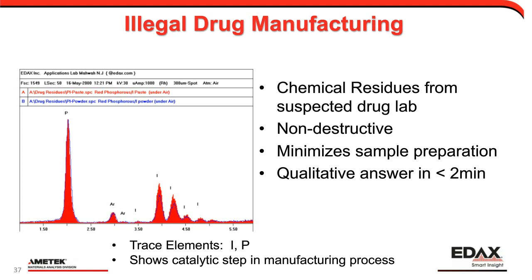The catalysts involved in making methamphetamines were phosphorus from match heads, and iodine from certain antiseptic solutions that you could buy at the drugstore. This type of analysis is non-destructive. You can do a quick screen of this, and if you need to do something further after that, you can take it and do other sorts of analysis with it.